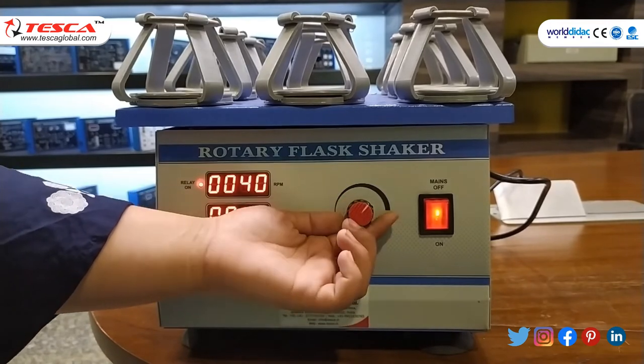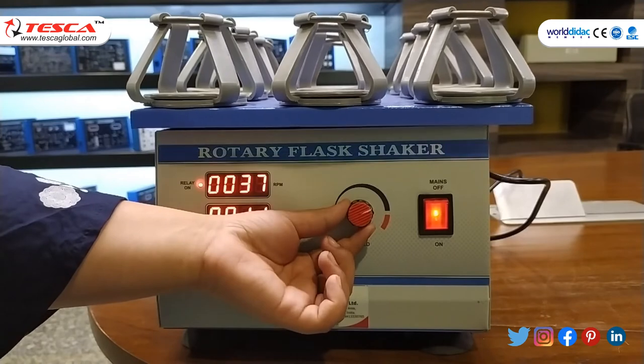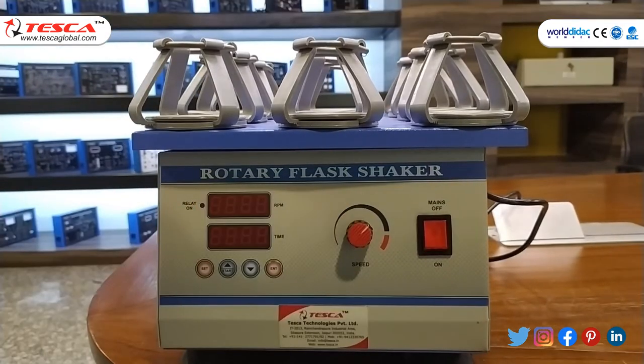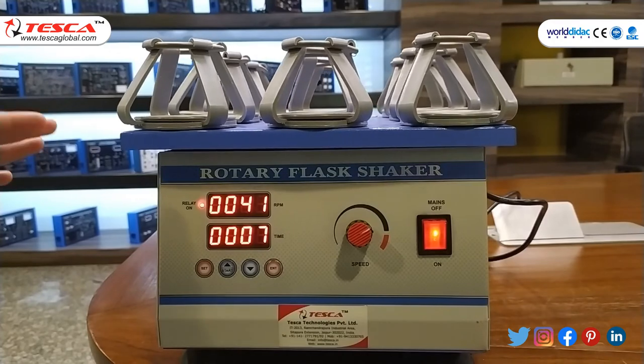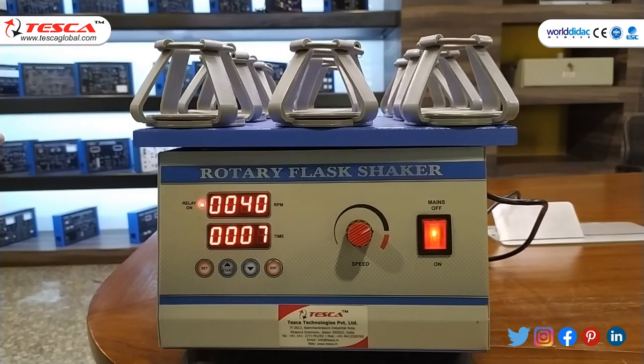As you can see, the rectangular plate starts rotating. You can also control the speed through this knob. It is basically used to mix and blend the substances provided in the conical flask and tube.